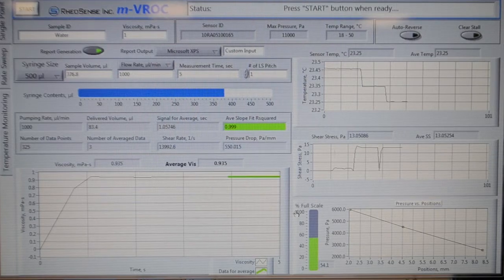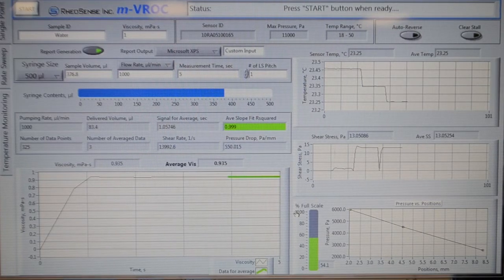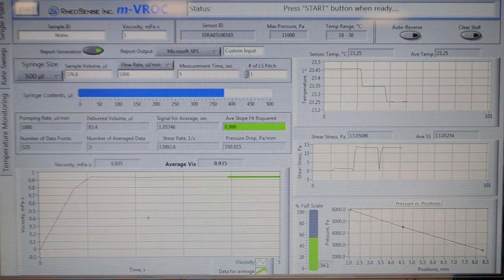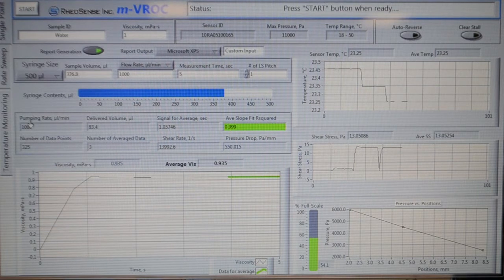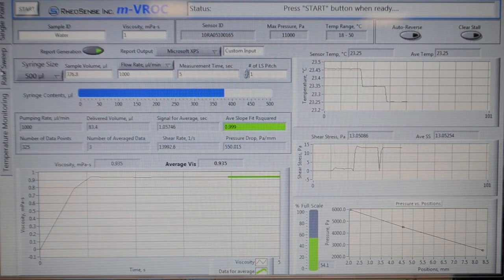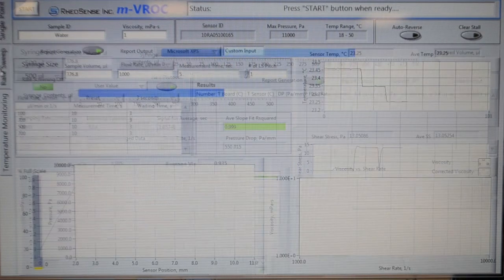Go ahead and click on the rate sweep tab. You can see it right there on the left-hand side.